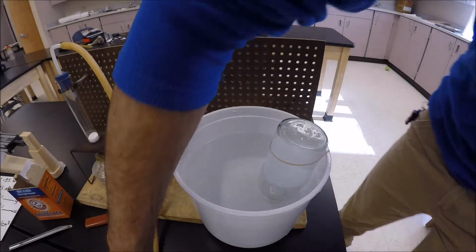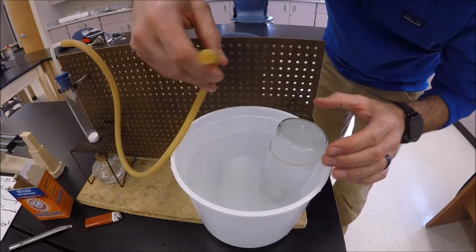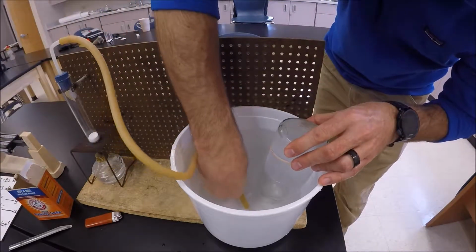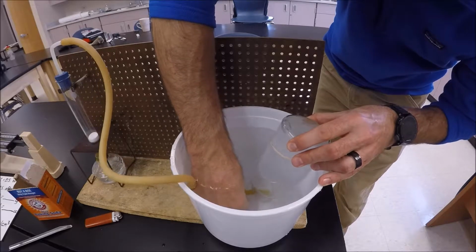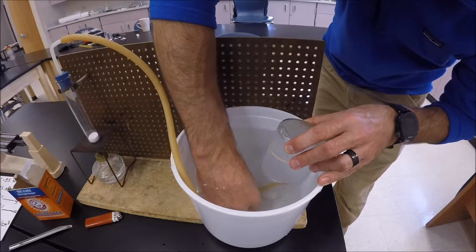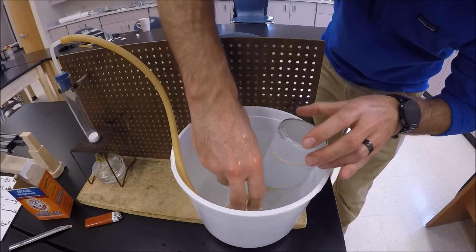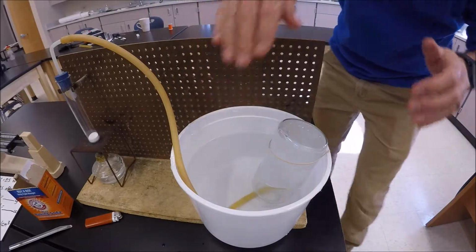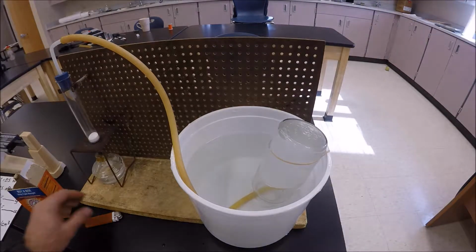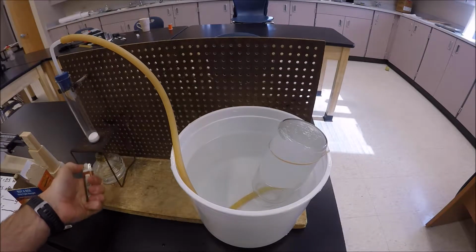Okay, so now that I've got this bucket over here, I'm going to be very careful and slide this tube up into the bottle itself. It doesn't have to go that far. I usually slide it up about a third of the way. Now what's going to happen is, as we heat up this baking soda, which I'll light right now, I'm going to light this guy here.